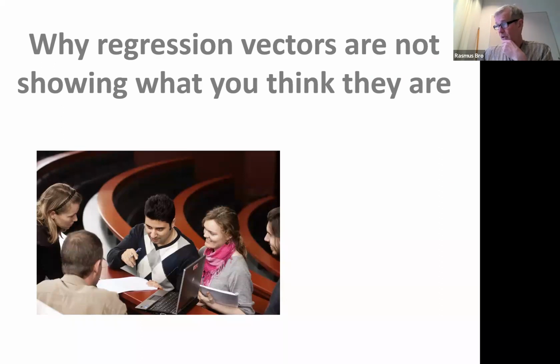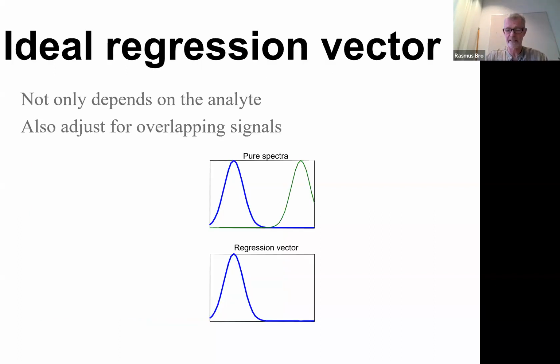Now, regression coefficients are something different. A regression coefficient is not directly related to a correlation at all. I want to talk about regression vectors because ultimately we tend to use them quite a lot for interpreting. In a lot of clinical or epidemiological research, the regression vectors are what people are looking at when they say wine is healthy or cheese is healthy or not healthy, etc. They are really looking at regression coefficients. So they are important. Now, let me explain regression vectors in a spectral setting.